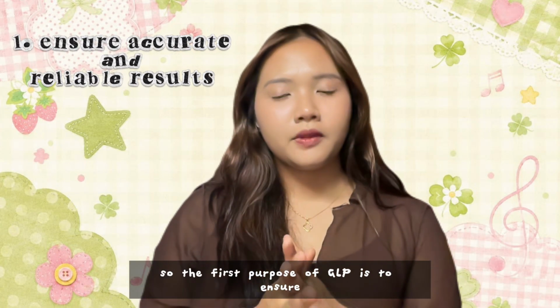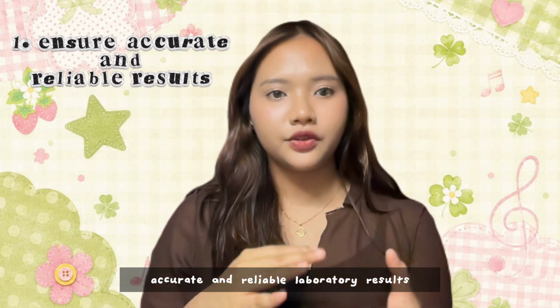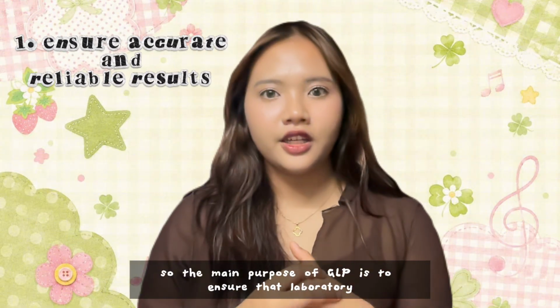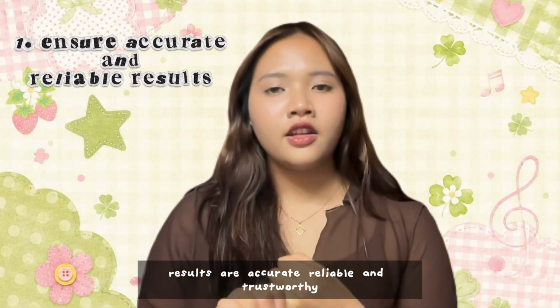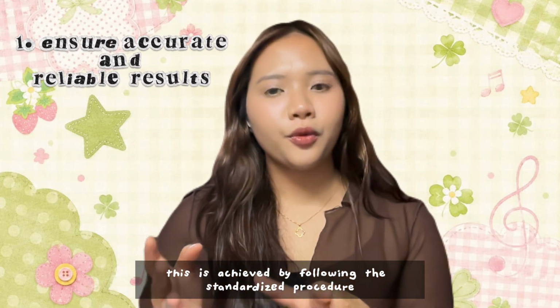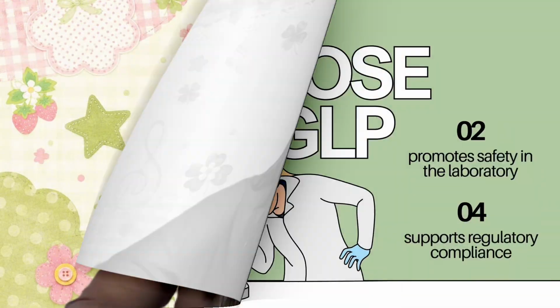So, the first purpose of GLP is to ensure accurate and reliable laboratory results. The main purpose of GLP is to ensure that laboratory results are accurate, reliable, and trustworthy. This is achieved by following the standardized procedure and minimizing errors during experiments.